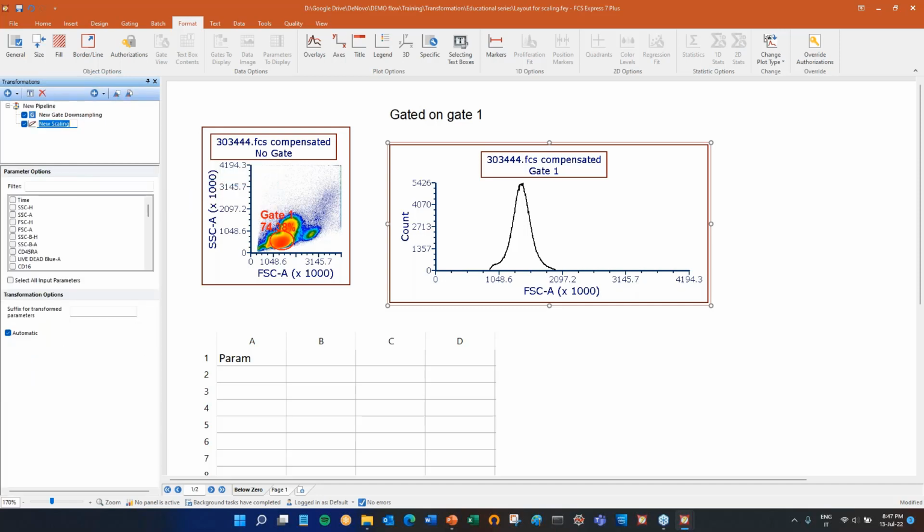In the meantime, there is a question: if you have inconsistency in staining intensity between samples, can scaling help make sample files more comparable for downstream tSNE UMAP? Not really. You can account for the spread of the data. If you have, for example, a negative or a positive which is more spread than the other one, you can do something with the scaling. But if you're speaking about the intensity, scaling will not really be helpful.